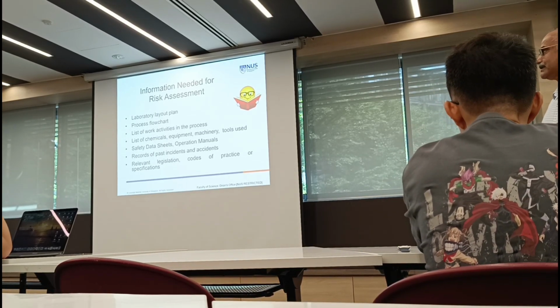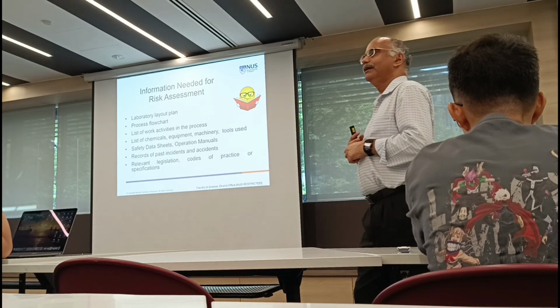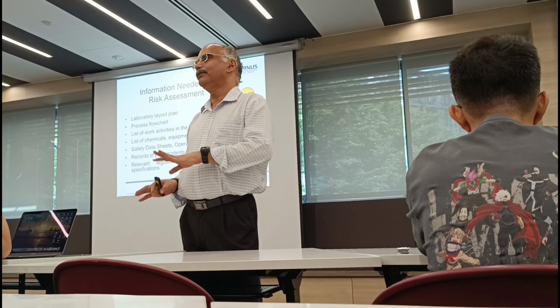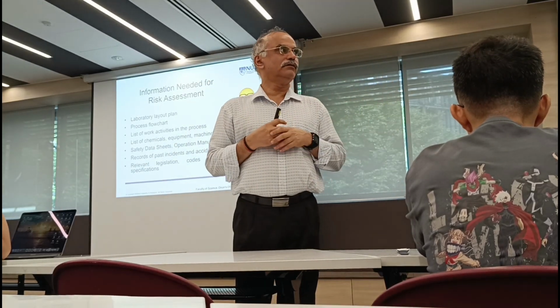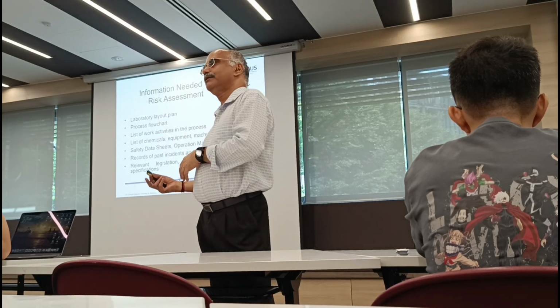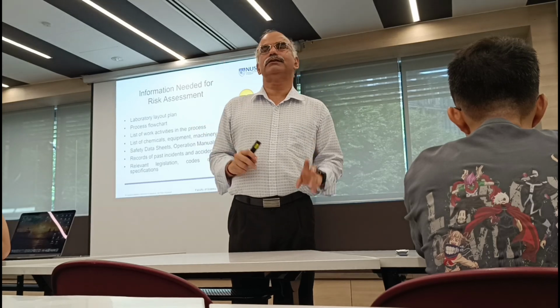And relevant legislation, codes of practice and specifications. So that is also important. You do not need to go through all those legislations and learn them, blah, blah, blah. No. You need to know something about what kind of chemicals are used. Is it very toxic? Is it poisonous? Is it explosive? How do you dispose of those wastes, etc., etc. Some information you should have. Yeah?